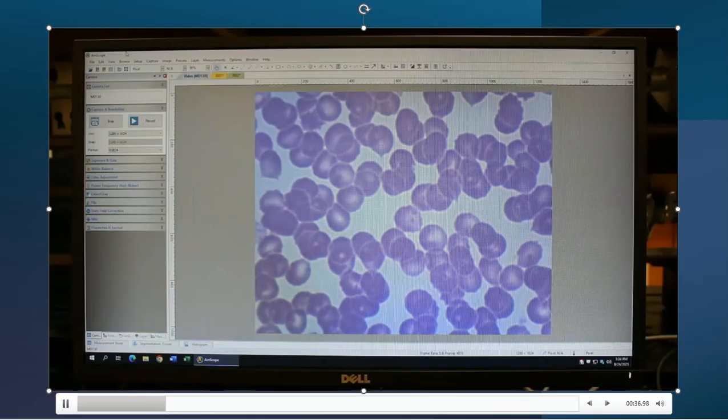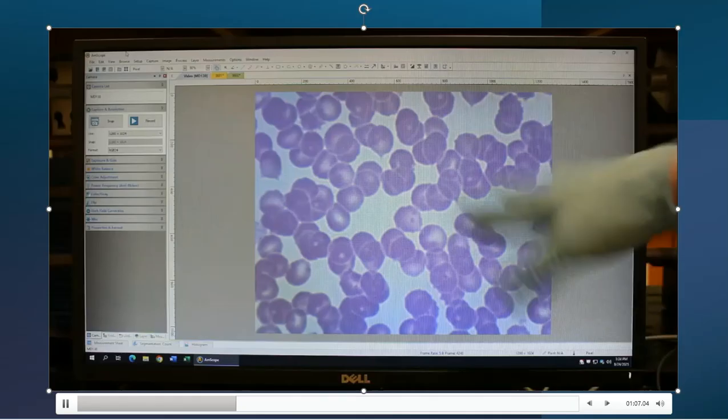Because let's think about this for a minute. On a crime scene, just because something looks like blood and it could have come from a human, well, a lot of things look red and like a blood sample that might not actually be from a human, but from something else. It could be from a pet. It could be from some kind of weird animal that was on the scene. Who knows? But this is going to help us identify, is that blood sample from a human? Yes or no? That's kind of what we're doing here in this activity. So that looks really good.